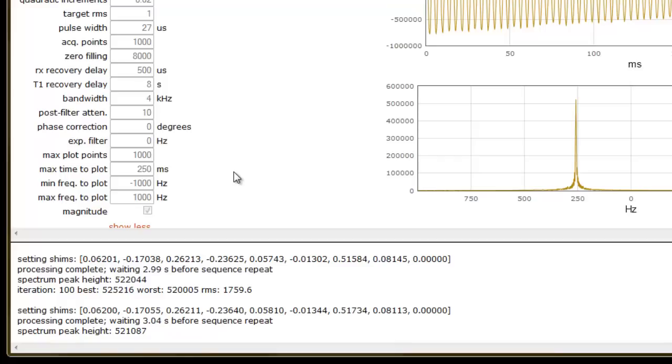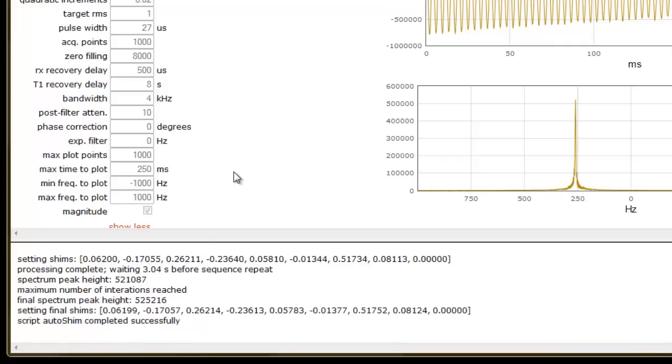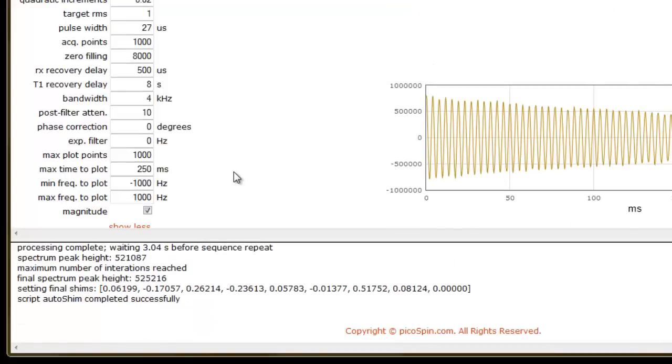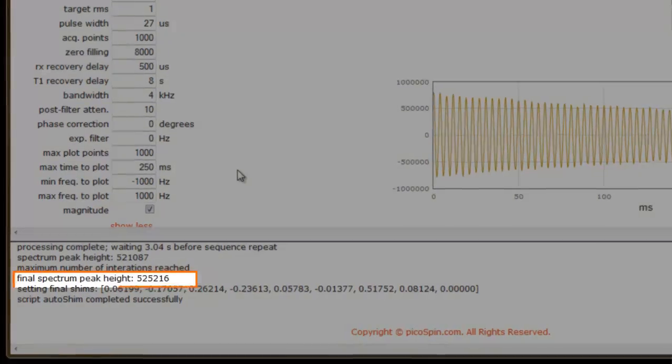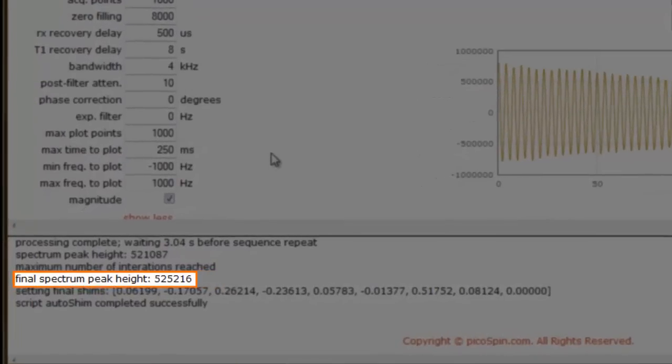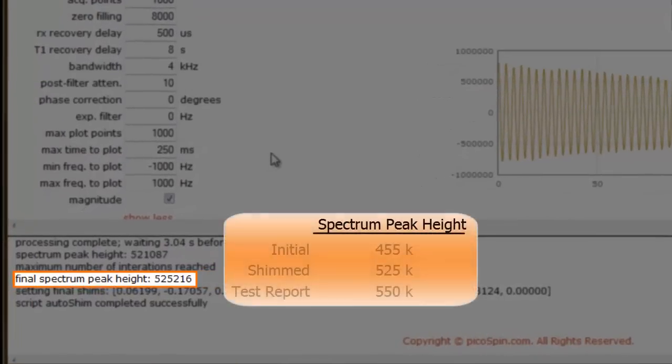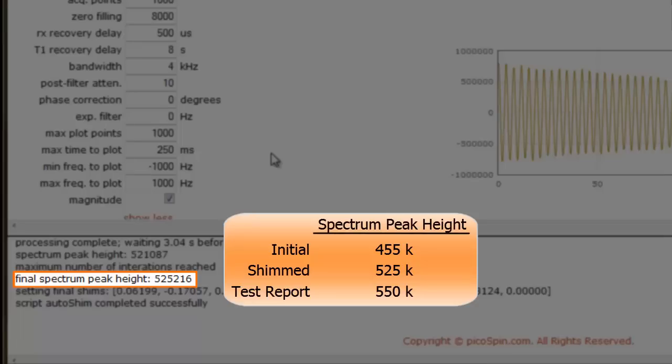Now that the AutoShim script is completed, let's evaluate our FID and spectrum. First, let's take note of the optimized spectrum peak height of 525,000. That's a pretty good value for my cartridge. Recall that our goal is approximately 550,000.